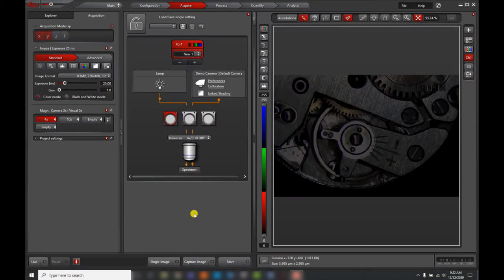This video tutorial provides users with a guide for setting up LASX Easy Mode to simplify the user interface. For a variety of reasons, it often makes sense for a Leica customer to transition from Leica's older version of basic imaging software called LAS to the more modern version called LASX.